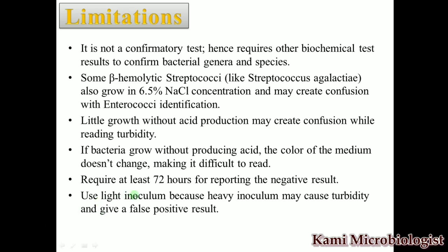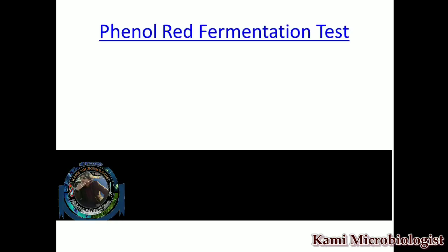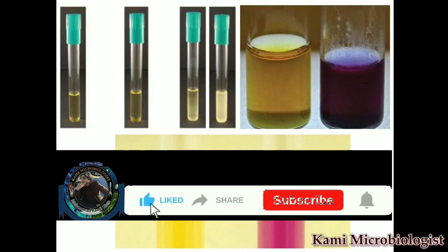Then next, we have to use a light inoculum, because a heavy inoculum can also cause turbidity and it will give a false positive result. Okay, so this is all about the salt tolerance test.